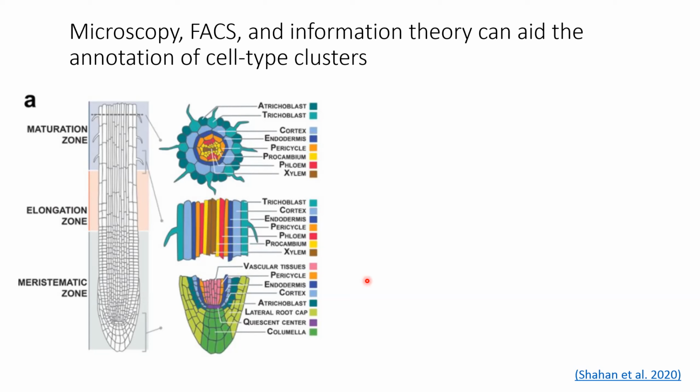Science is an iterative process, and prior biological knowledge is an important reference point, and having new technologies with increased resolution can either provide supporting evidence of prior knowledge, or it can falsify the knowledge and create epistemological turbulence and sites for new concepts to be created. So we don't want to lean too heavily on prior knowledge to inform our cell clusters, because this prior knowledge was created with less accurate or more poorly resolved or a lower number of measurements in the technology, and these kinds of tools could be misleading to our concept of a cell type.